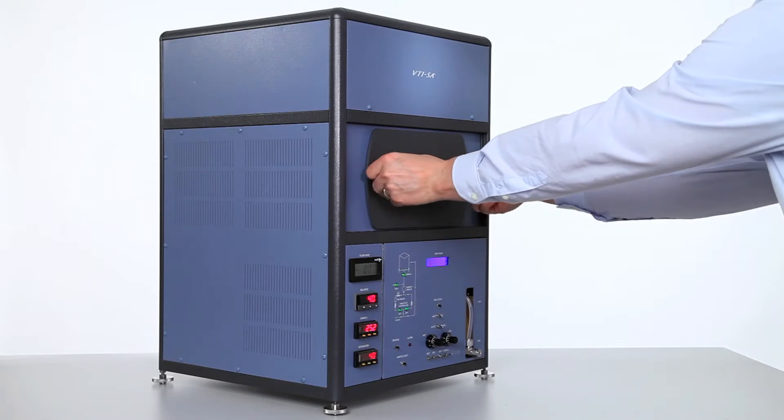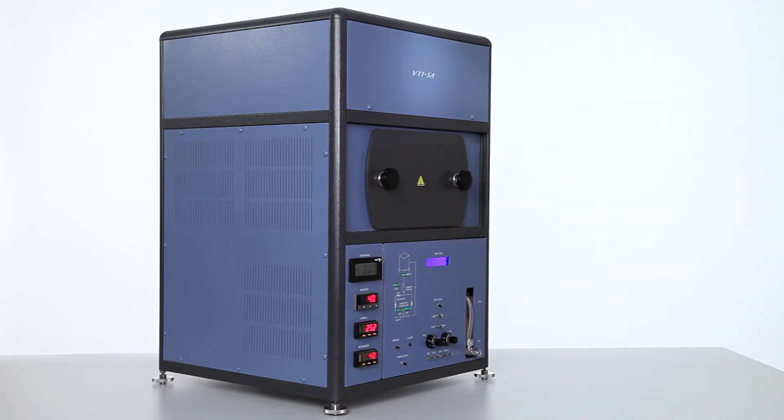We are now ready to set up a water sorption experiment using the control software.